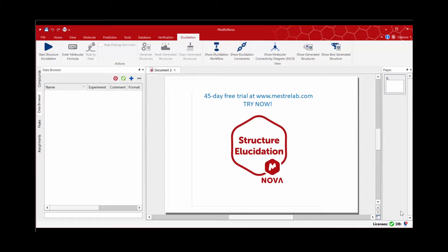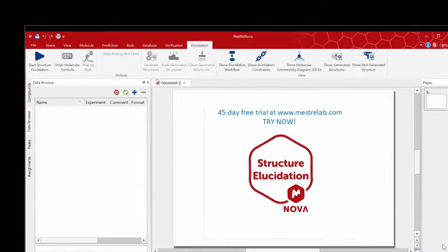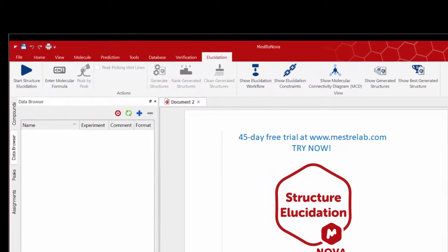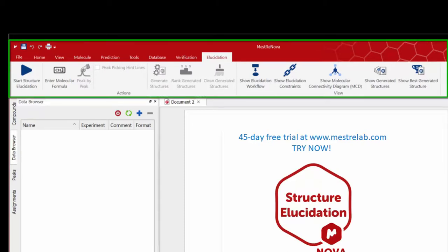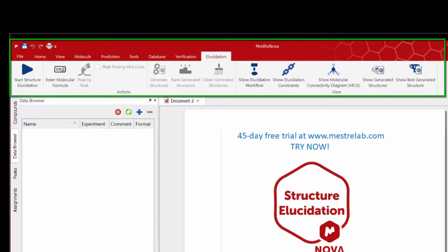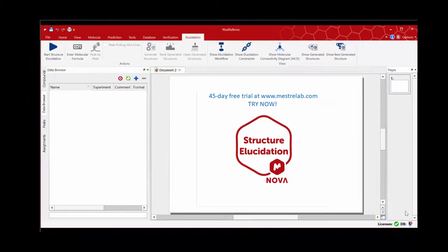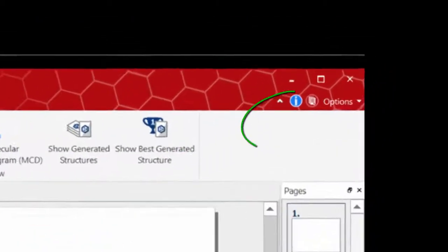The first thing we do is go to the elucidation settings located in MNOVA's menu. Please note that for this video I am using the modern display ribbon control, but you can also choose to revert to the classic display if you wish.